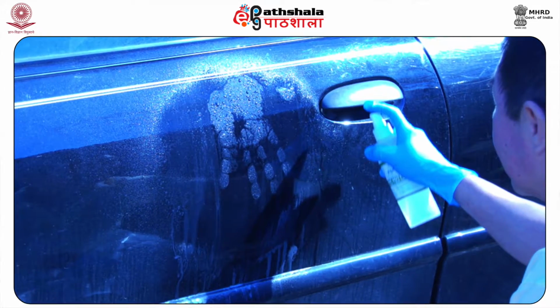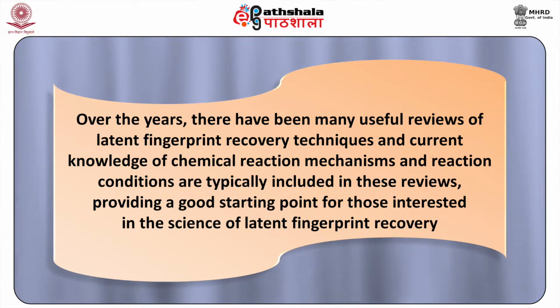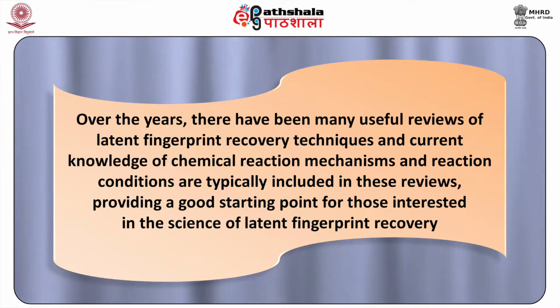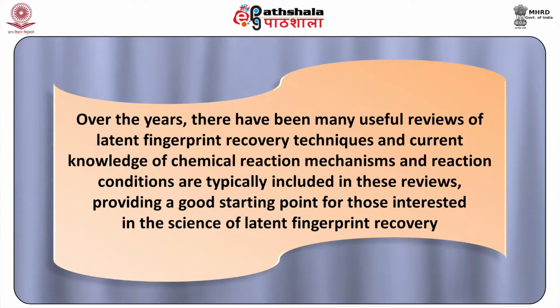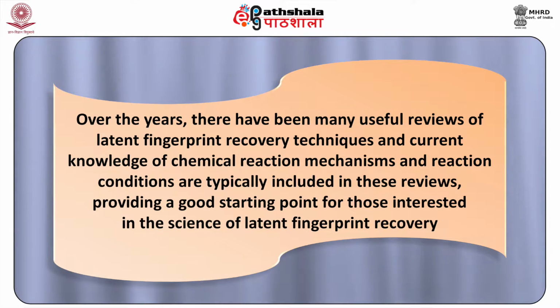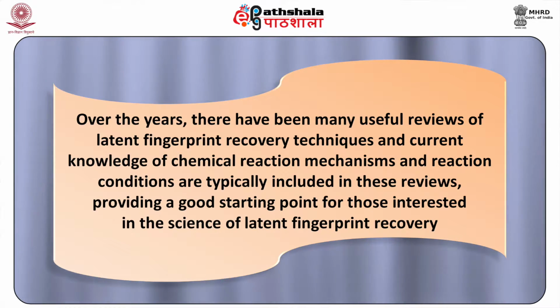To this end, a variety of chemical reagents and associated methods have been successfully developed for visualizing latent fingerprints, some of which are routine and others that are more specialized. Over the years, there have been many useful reviews of latent fingerprint recovery techniques, and current knowledge of chemical reaction mechanism and reaction conditions are typically included in these reviews, providing a good starting point for those interested in the science of latent fingerprint recovery.